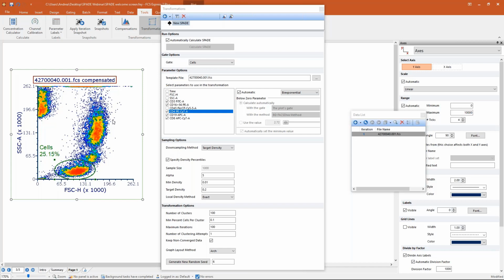If you think that this variability, okay, so you see I have some cells at 65,000, some cells at 131,000, if you think that this variability is not because of the biology, so it's not because some subsets have a higher forward scatter and some other subsets have lower forward scatter, and it's just because of the instrument variability, in that case it means that forward scatter is not informative. Okay, so you can skip it.